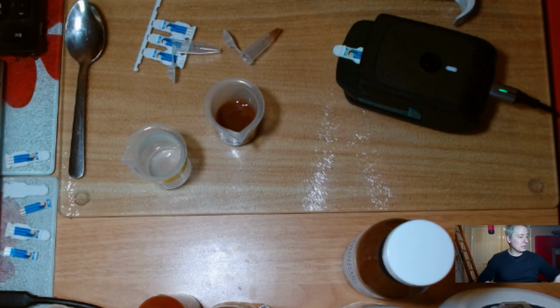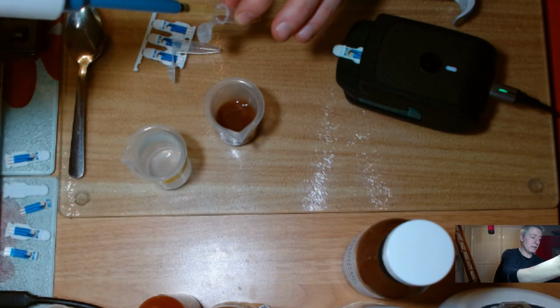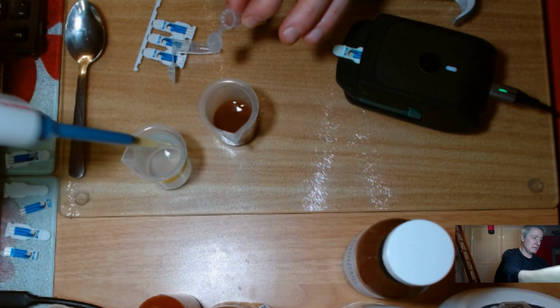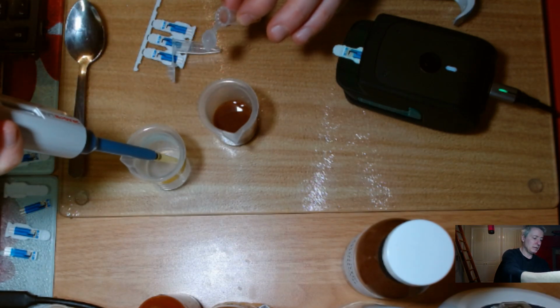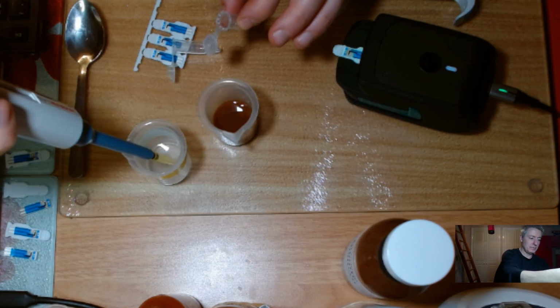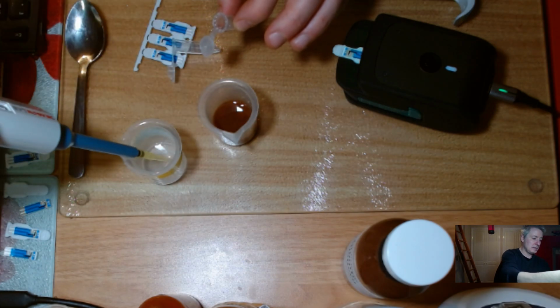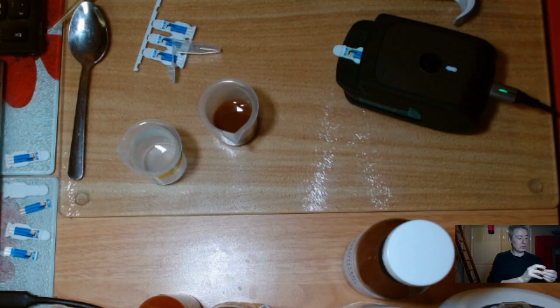Right, so I took 100 microliters of that. I need 900 microliters of the buffer. So I'll do that now. 1, 2, 3, 4, 5, 6, 7, 8, and 9. Right, and now what I'll do is I will close the lid up.